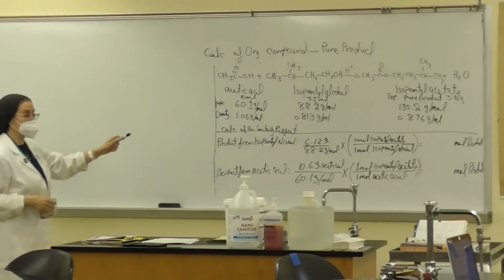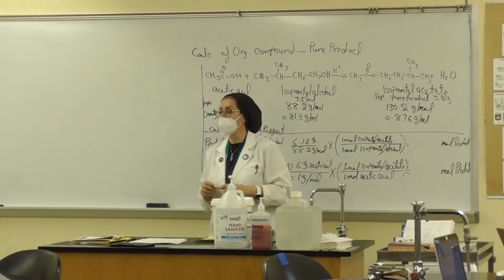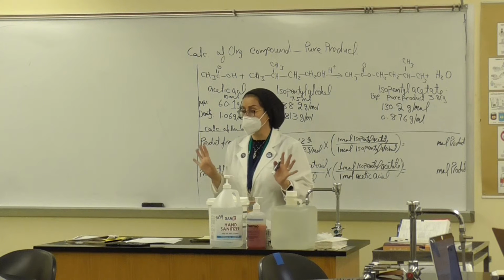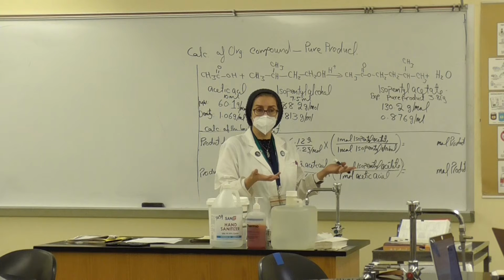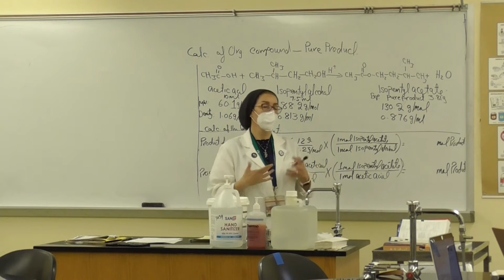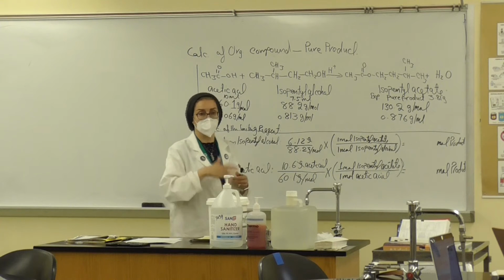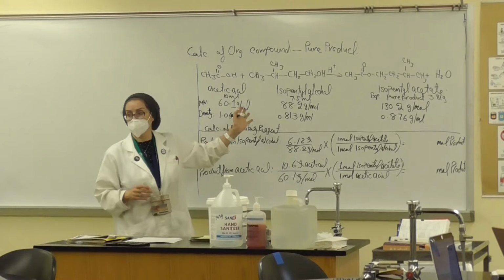We will prepare this product, which is isopentyl acetate, and this is banana oil. Banana oil, it's like an extraction, but it is going to be prepared industrially. So these are the additives that you have, like food additives or colors. Not all of them are from an organic product or natural produce. Some of them are synthetic. So this is a synthesis reaction.